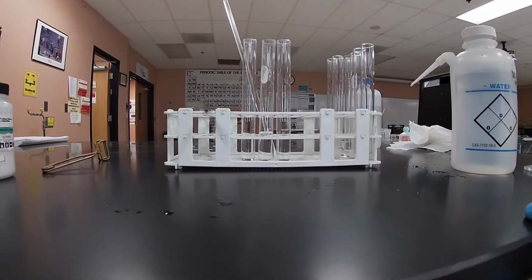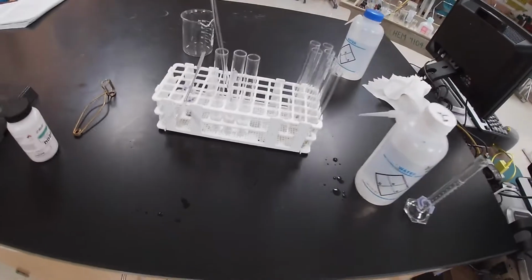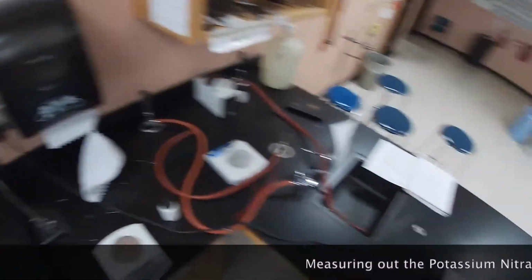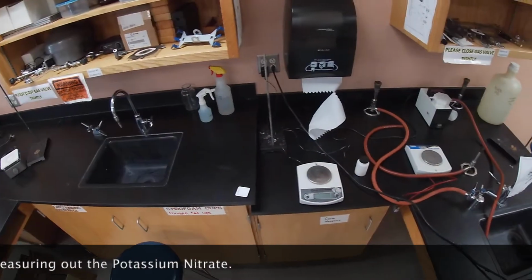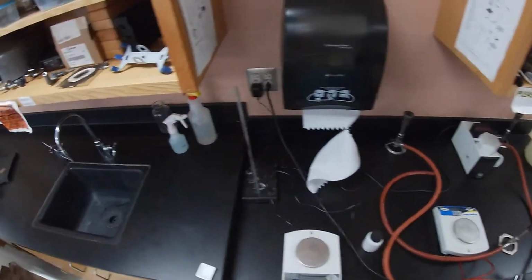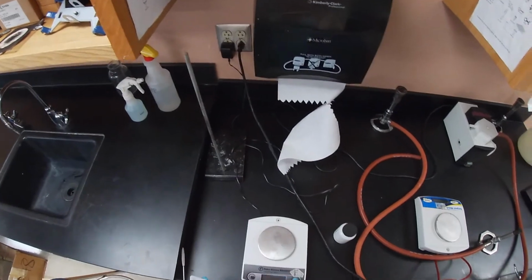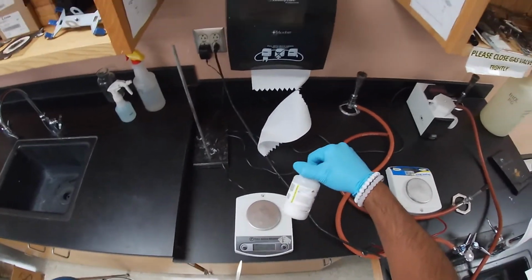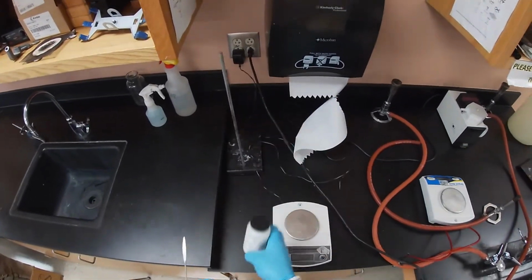out our potassium nitrate. And we're gonna first measure out our potassium nitrate. Okay, so then what we're gonna do next is, oh, I forgot my spatula. Where did I put it? Oh, here it is. So we're gonna go ahead and measure out 3 grams of the ammonium nitrate. And so here we're gonna have our scale, and ammonium nitrate. I'm sorry, our potassium nitrate.